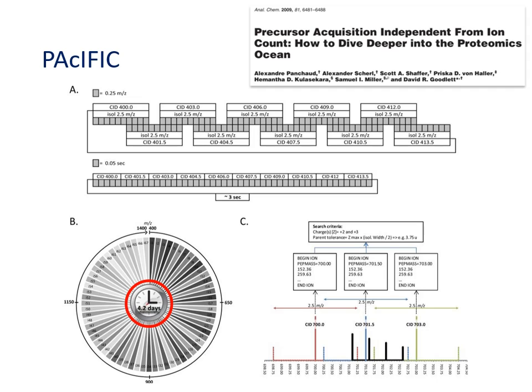The downside of this approach is that such in-depth analysis inevitably takes a long time. In the example in the paper, it takes over 4 days. But the benefit is that you know the fragment ions must have come from a parent ion within a relatively narrow mass range. And that means it's relatively easy to search this admittedly enormous dataset against normal libraries using conventional software.